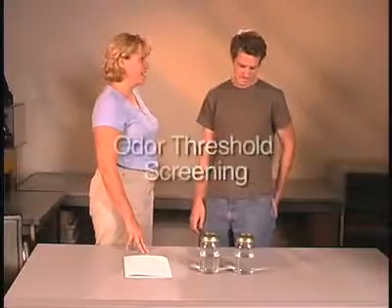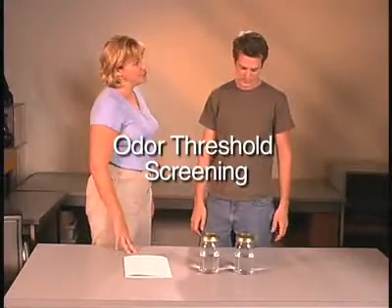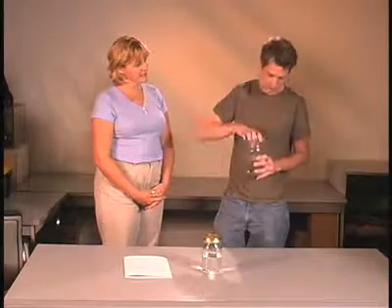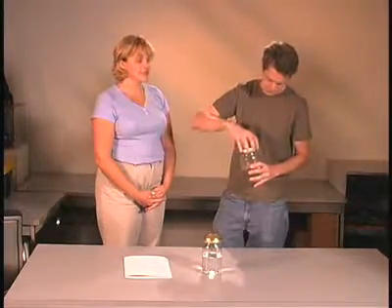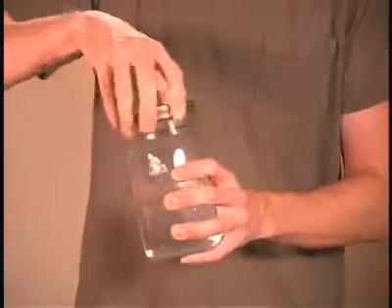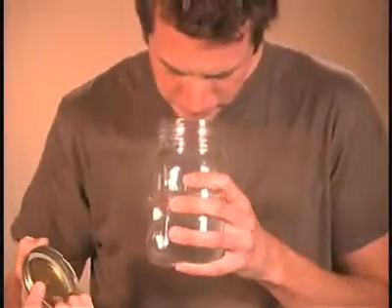Before beginning qualitative fit testing with isoamyl acetate, conduct odor threshold screening. Expose the test subject to isoamyl acetate to determine the subject's ability to smell its banana-like odor. If the subject can detect the smell of bananas, have him or her proceed to the selection process.